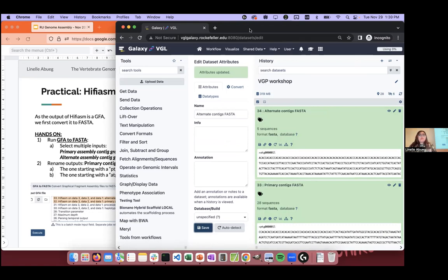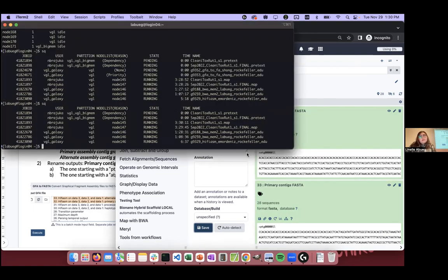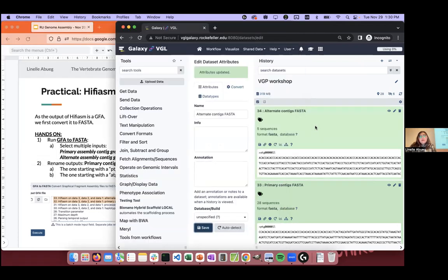Wait a minute to see if anything is still running.